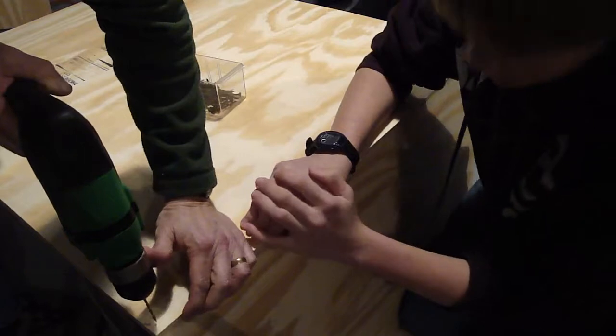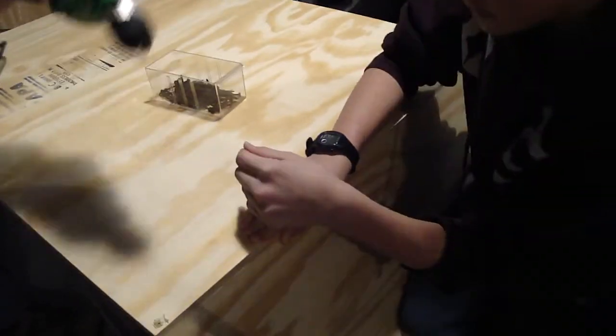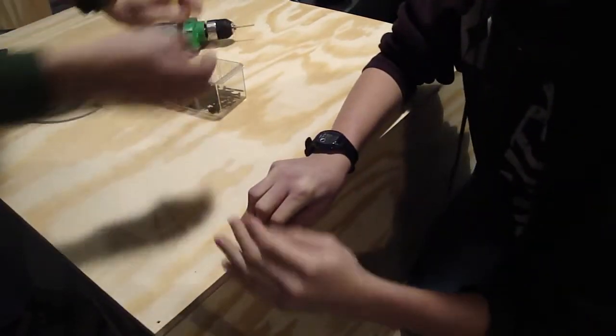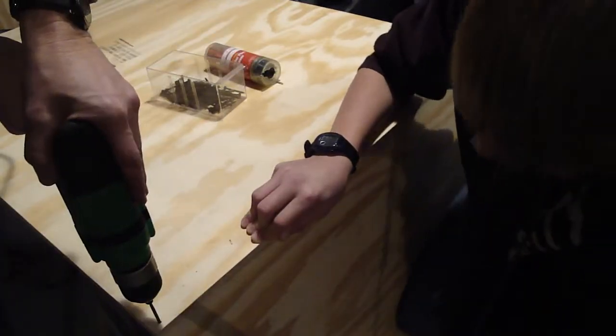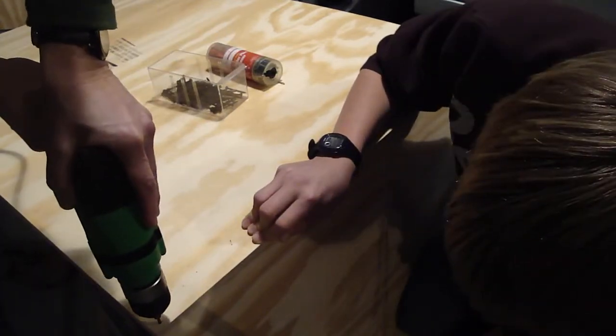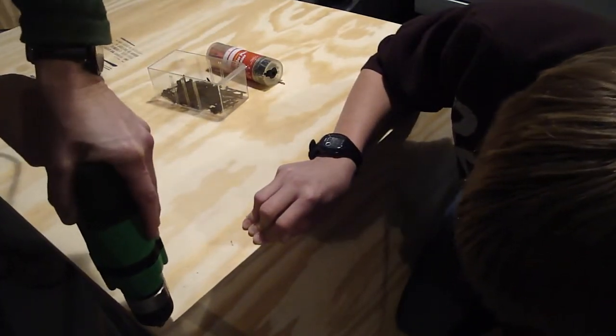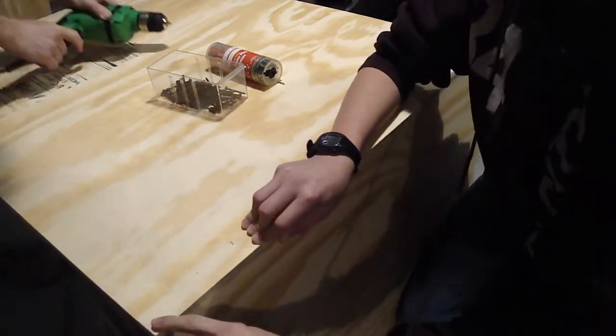We're going to drill the first hole. Now we're going to put a screw in. Got it nice and tight.